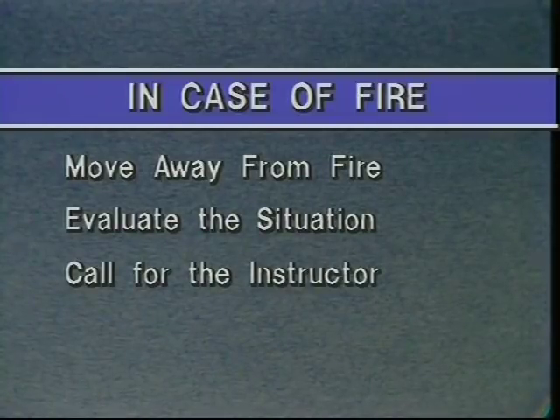Three actions must be taken immediately. Move away from the fire so you don't get burned. Evaluate the situation and call for the instructor. While you are evaluating the fire, decide whether it's containable and what chemicals are nearby. Your instructor may use a fire extinguisher or take other action, such as evacuating the lab.